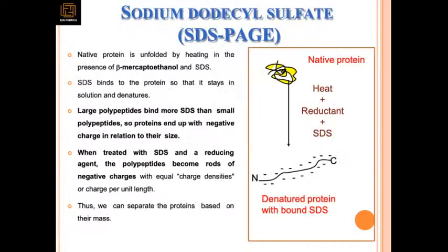SDS-PAGE we will see in the Western blotting.